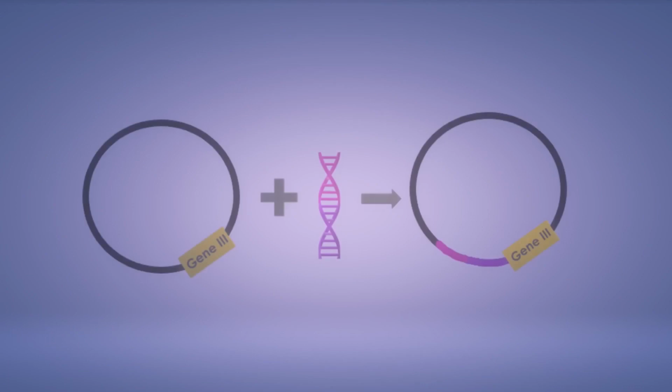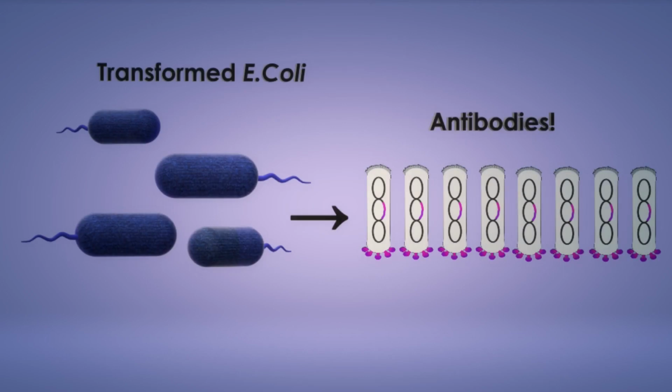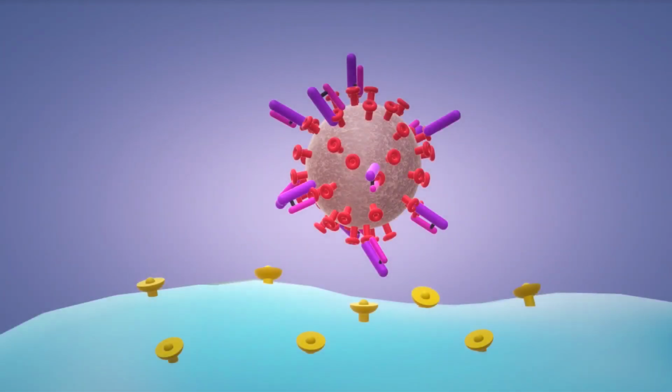fragment. The amplified cDNA is inserted then into a phagemid. The phagemid is used for E. coli transformation, and then the bacteria are infected by helper phages so as to induce the expression of the phage. The result is that the bacteria express and release phage particles containing the vector DNA, showing the engineered antibody protein on their surfaces. This way, we've created phages that act as antibodies that will bind to the spike proteins of the COVID-19 virus, and this binding will stop the interaction between the ACE2 receptor and the spike proteins of COVID-19.